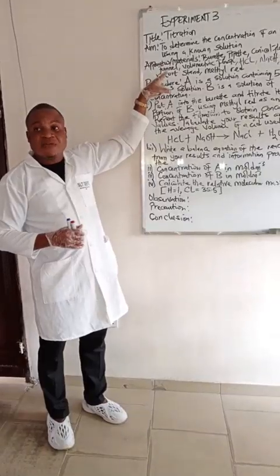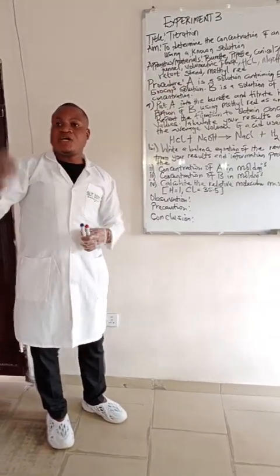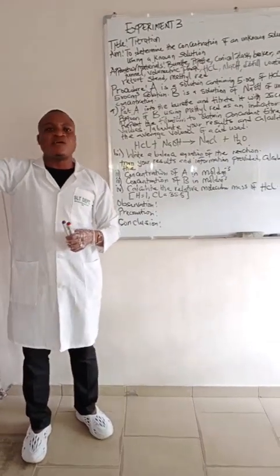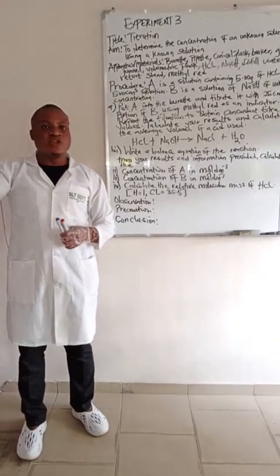Titration, so to say. Are you with me? Like one of the precautions, when you are using the burette, it's advisable for you to rinse it with water as well as the acid which the burette is going to contain.